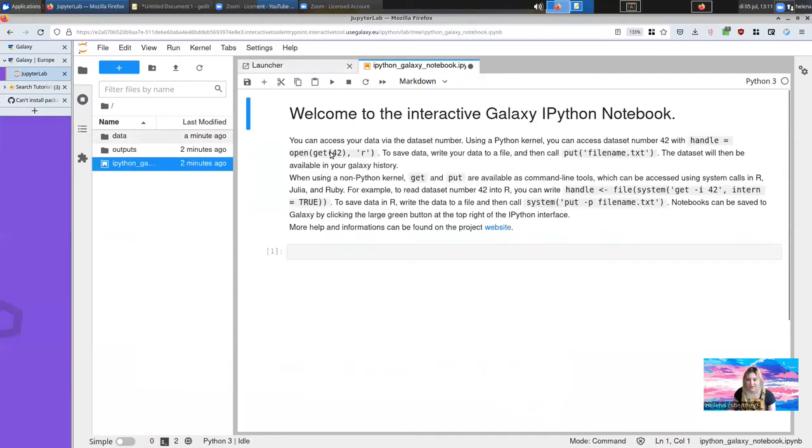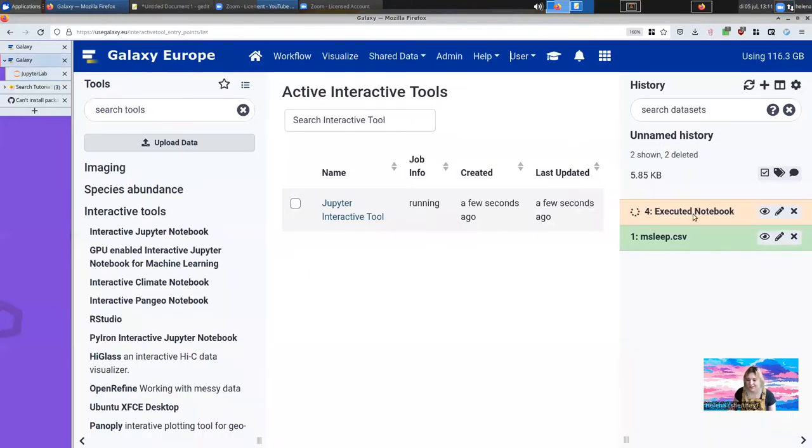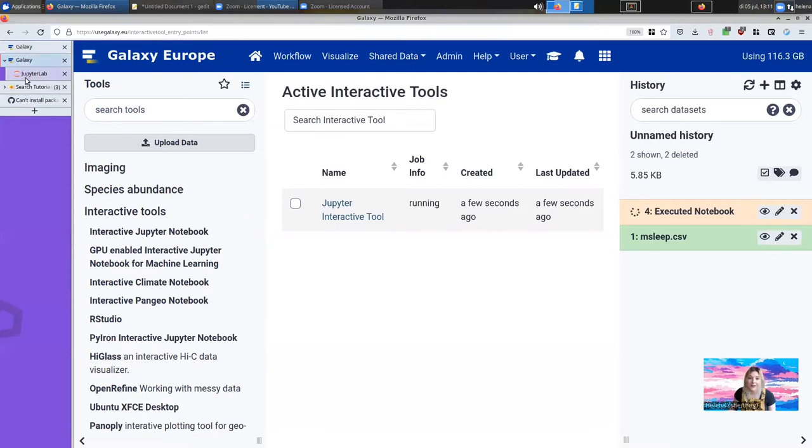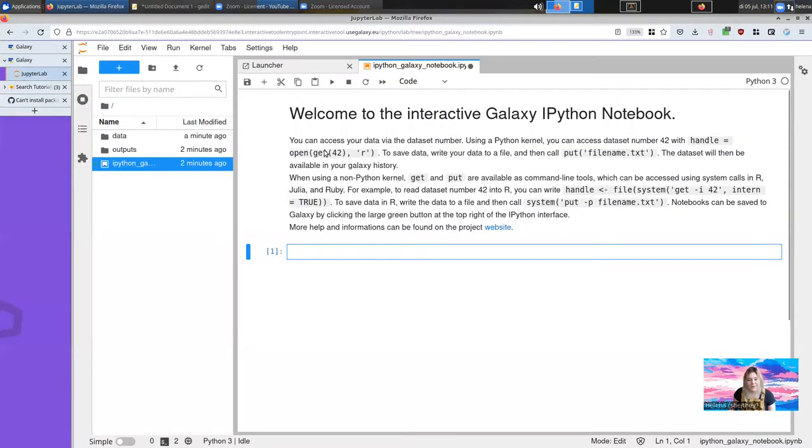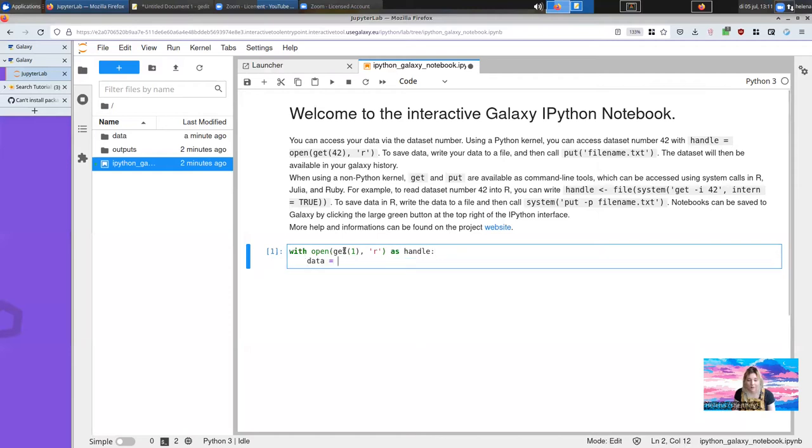You'll note this little introduction at the top. You can use that to access all the data in your Galaxy history. So if I look back in my Galaxy history, I have this ID 1 in front of the CSV file. You can use the get function that's automatically loaded to process that or to download it from Galaxy.